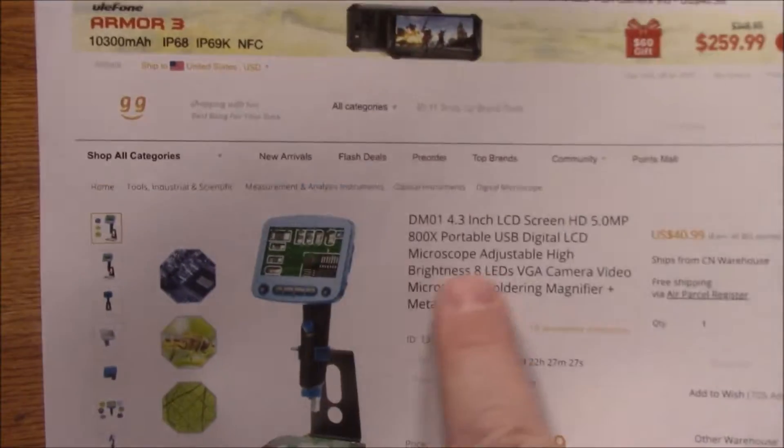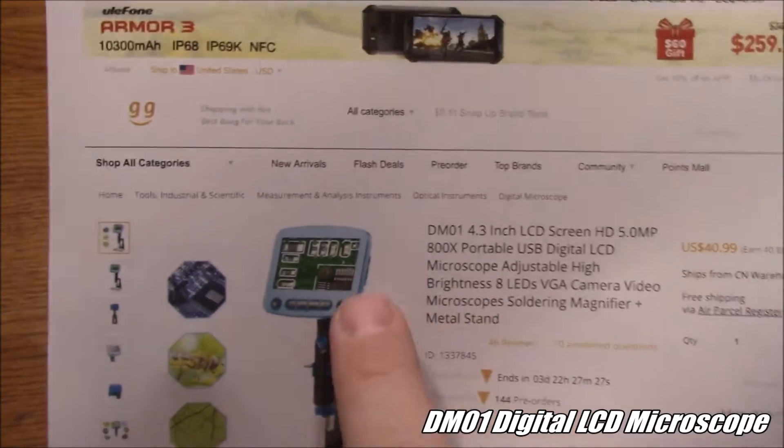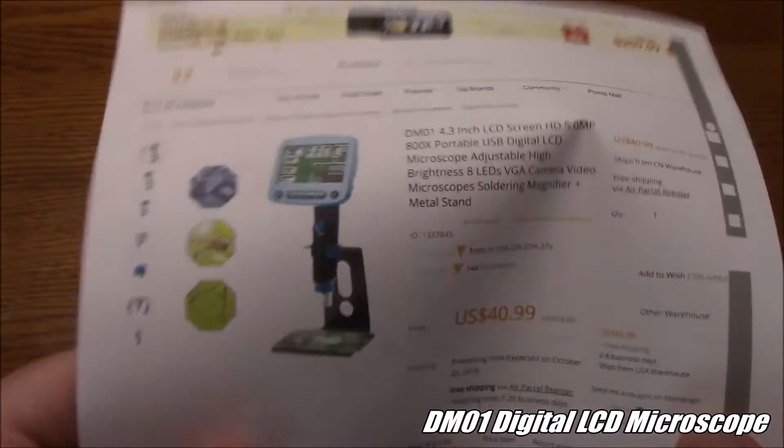My eyes are not what they used to be. Today we're taking a look at this LCD microscope, which uses a small screen instead of using an eyepiece.